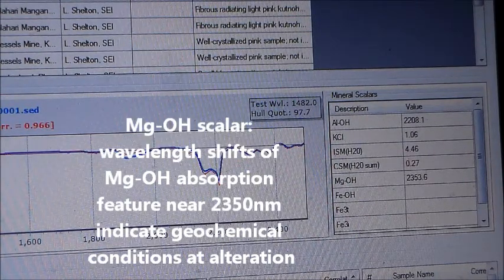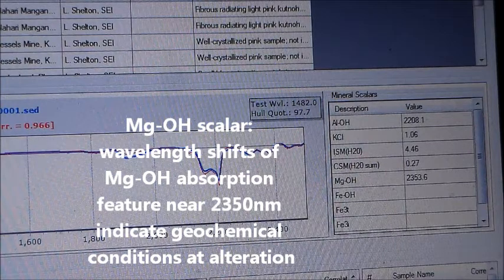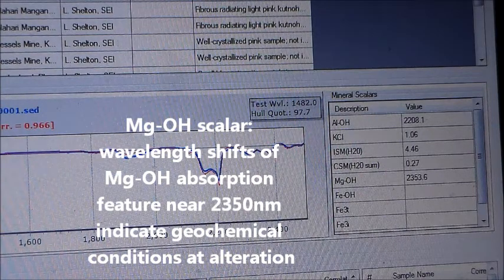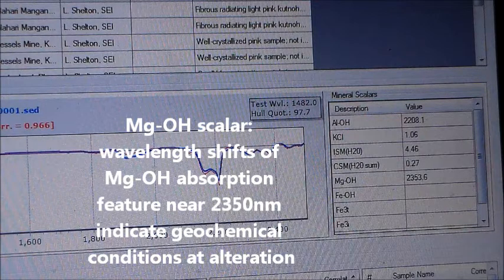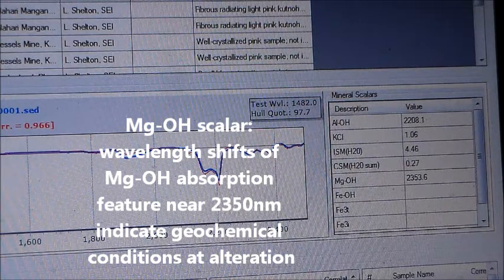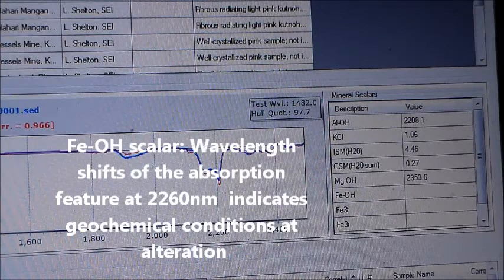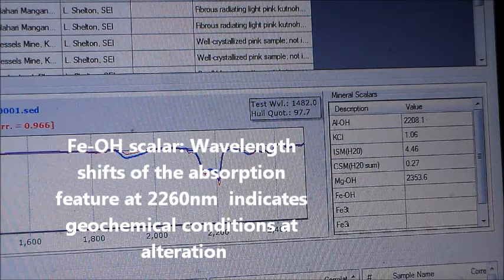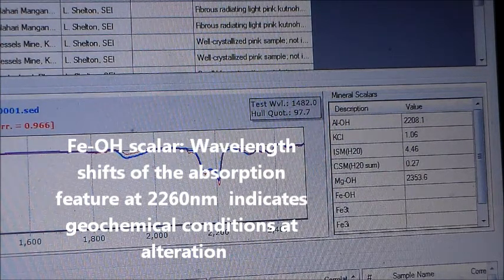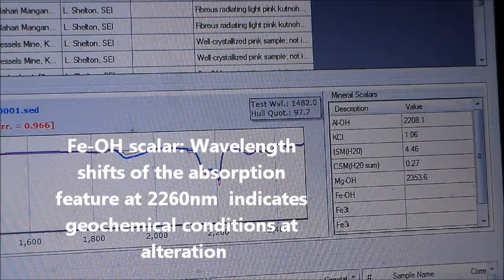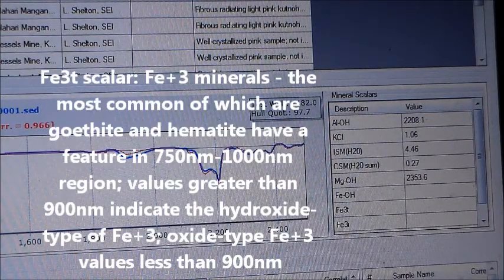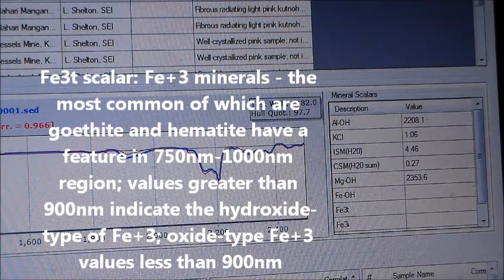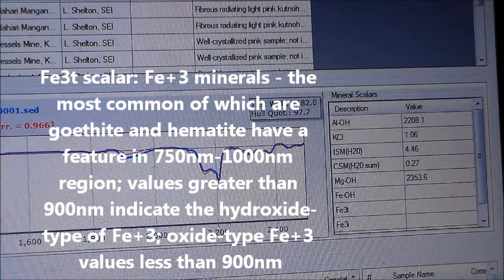The MgOH scaler tracks the wavelength shift of the MgOH absorption feature near 2350 nanometers as an indicator of geochemical conditions at alteration. The FeOH scaler uses the wavelength shift of the absorption feature at 2260 nanometers as an indication of geochemical conditions at alteration. The Fe3 scaler measures Fe3 minerals, commonly goethite and hematite, which have a feature in the 750 to 1000 nanometer region.